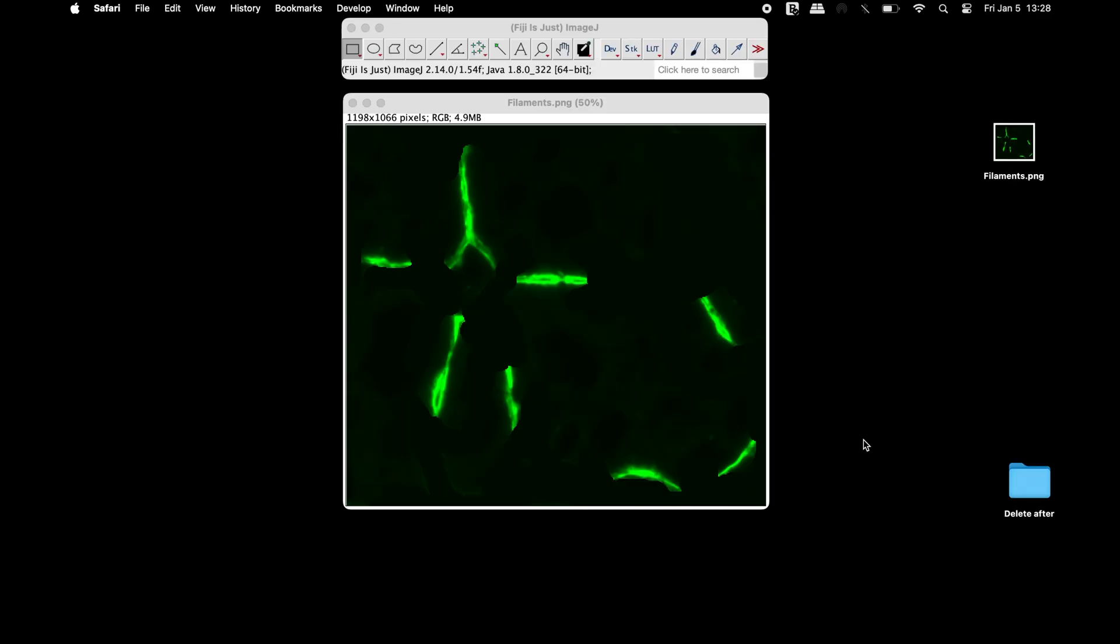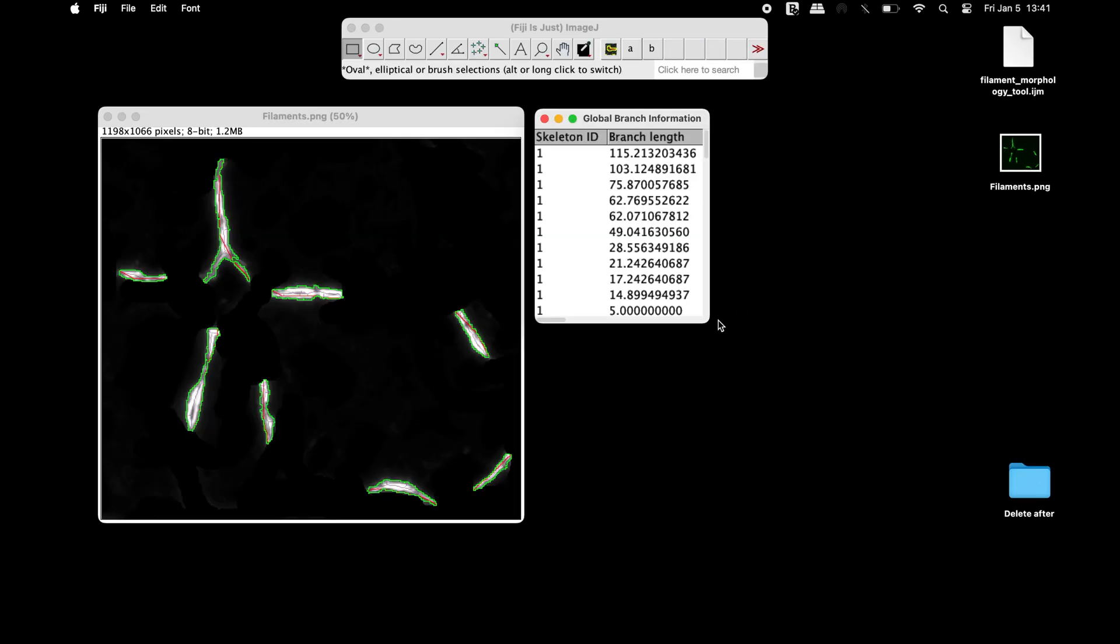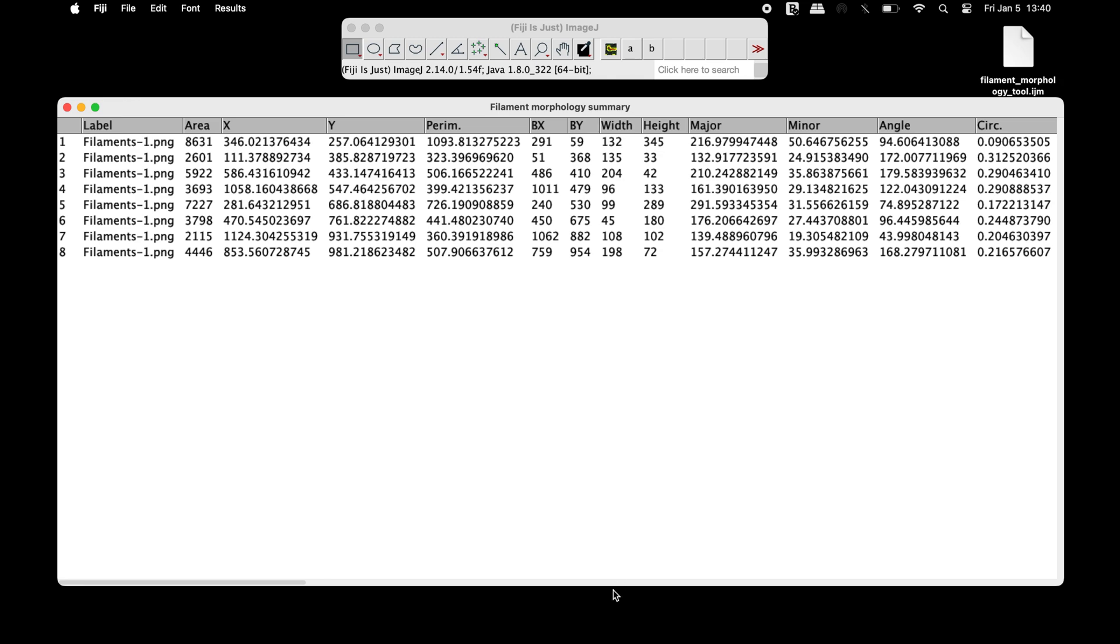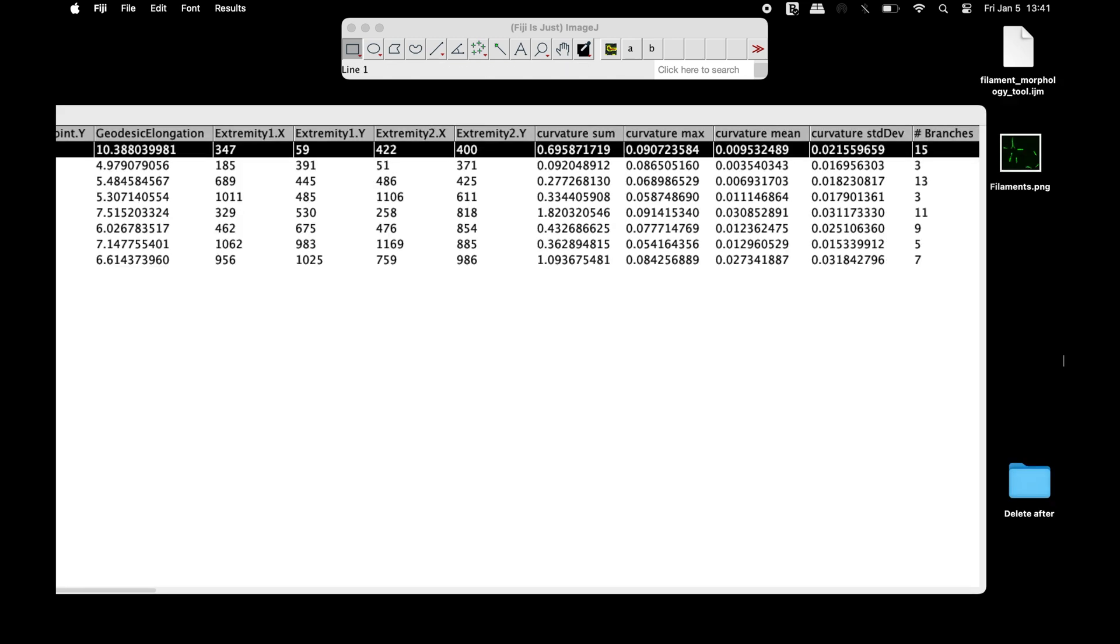To measure the morphology of filaments, length and their curvature, and the number of branches, a macro can be used.